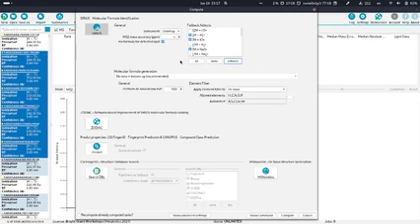If you just have a peak list, there's no way to decide if it's an in-source fragment or not, so you just have to provide that. The idea of the fallback adducts is exactly that you say, please consider this kind of adducts, and it will then compute data for all these adducts. If you now have M plus H and M plus H minus H2O, then there's no way to distinguish them. But if you then do a structured database search, it will look into both candidate lists.